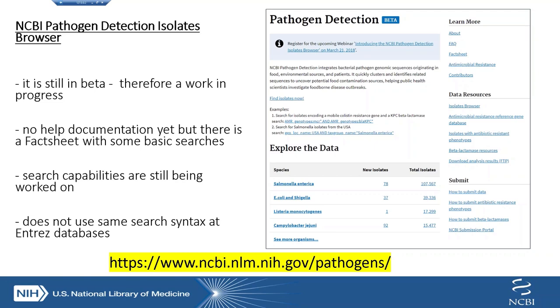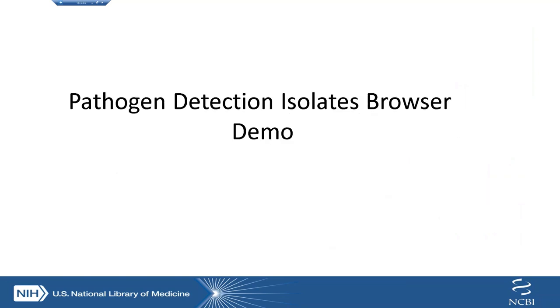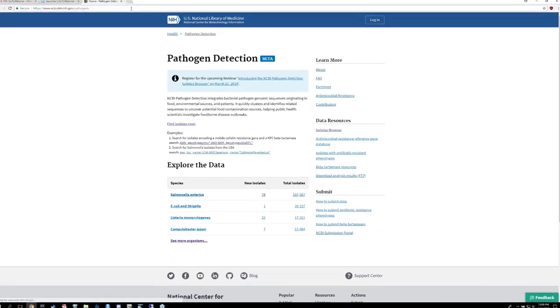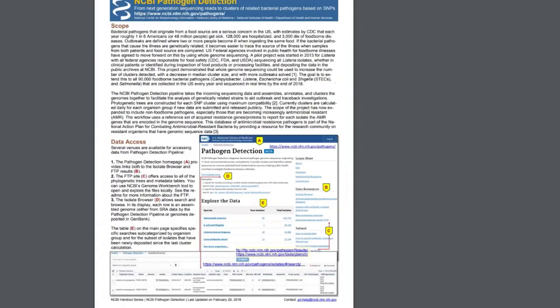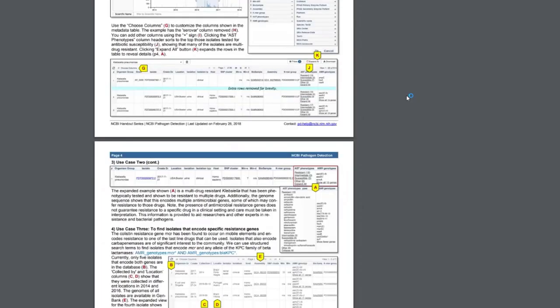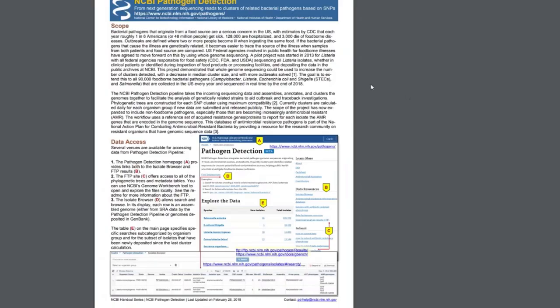The search syntax is not the same as what you'd typically see in Entrez databases like Nucleotide or Genome. So I'm just going to give you a demo. It's available at the base URL slash pathogens. This page gives you a brief description, has a couple of example searches, and then some basic information including the fact sheet. The fact sheet covers some basic examples of how to do searches, information on antimicrobial resistance, reference databases, and how to submit data.